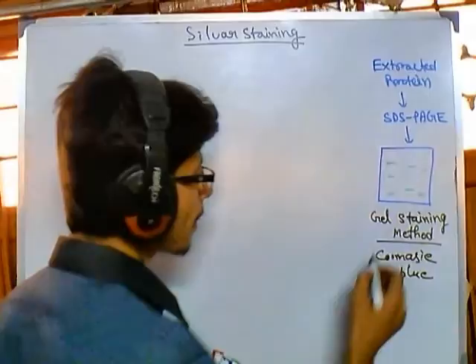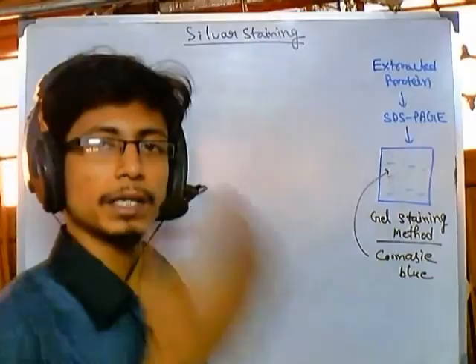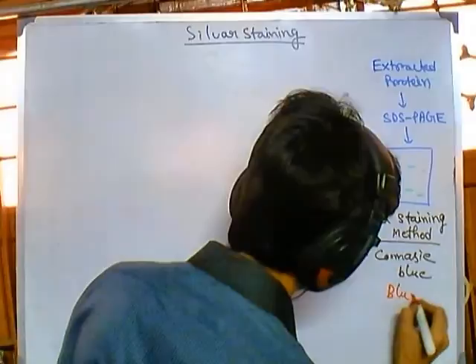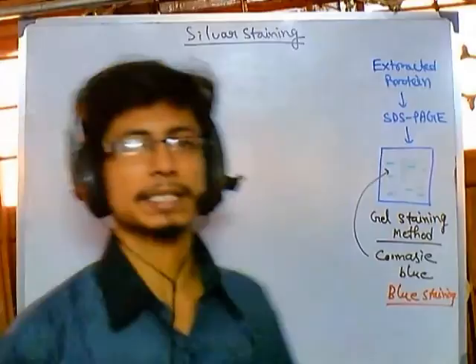We add this Coomassie blue and keep the gel overnight, then we come and rinse it 2 or 3 times, and we get visualization of dark, beautiful blue-colored bands. As the name suggests, it gives us blue staining, right? But this Coomassie blue is not very sensitive, because we get many proteins here.